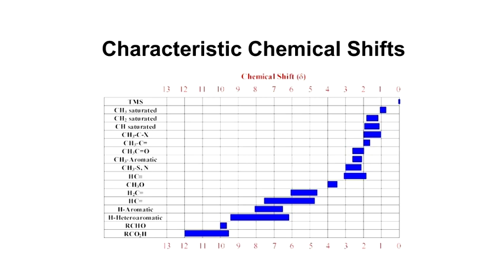And if you've got this memorized, it is actually possible to look at an NMR spectrum and reasonably accurately figure out what the components are and what the molecule looks like. So the chemical shifts help in one regard. The coupling constants help in another regard.